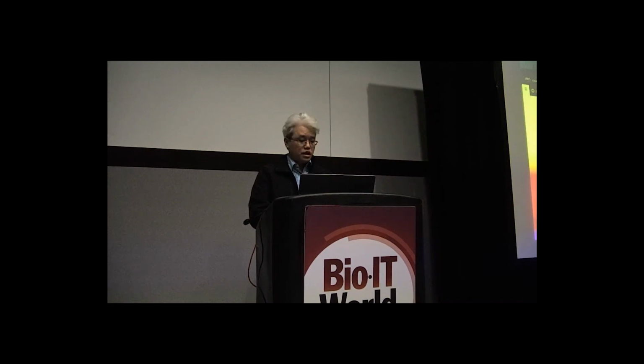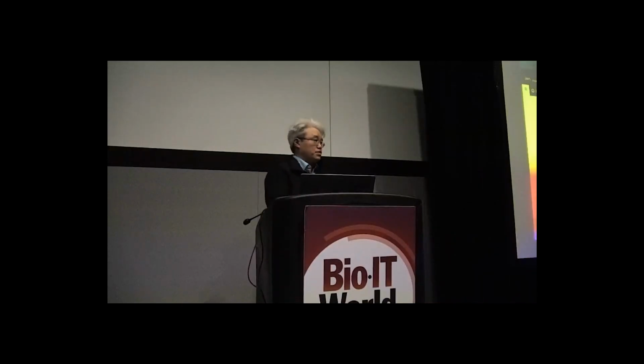And so this should take just a couple of minutes. But once it is done, you should have something that looks like this. So I'm just going to go back and look at a pre-imported one that is here. So this is HG38. It goes by many names. The more common one, or the more recent one, is GRCh38. And you get various details here.